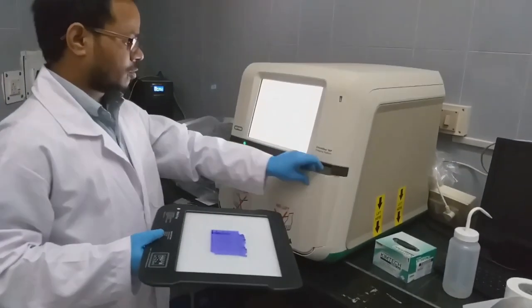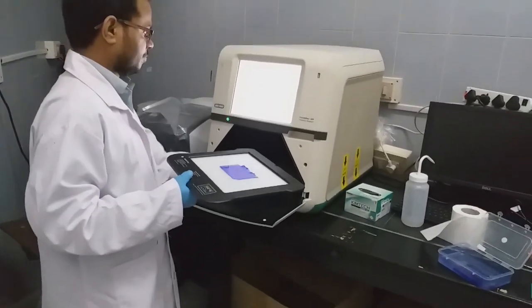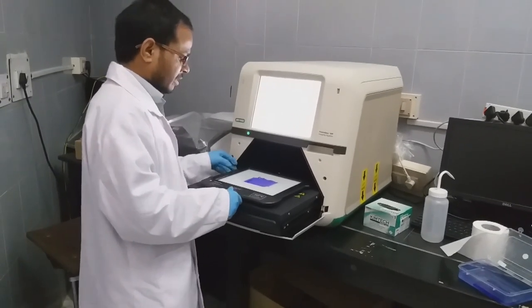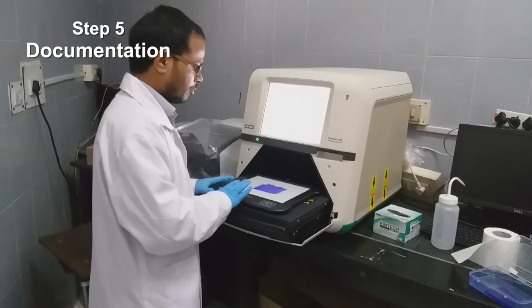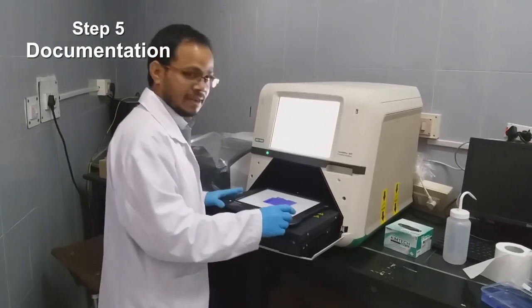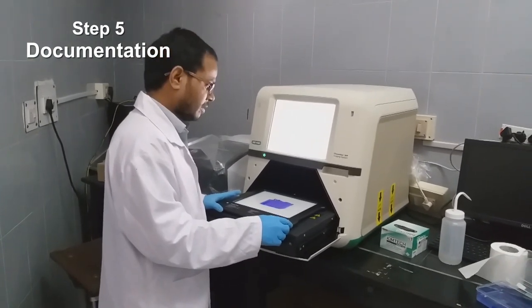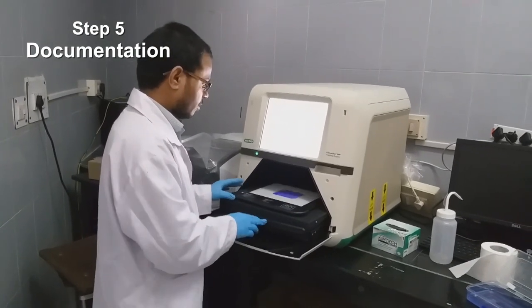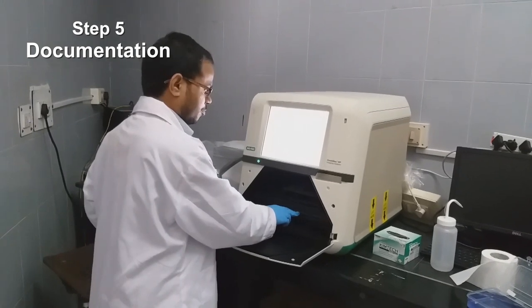So we have to open properly. This is a very important step. You have to align the tray in a proper way, otherwise it will show error. So once it is over, you just push it back.